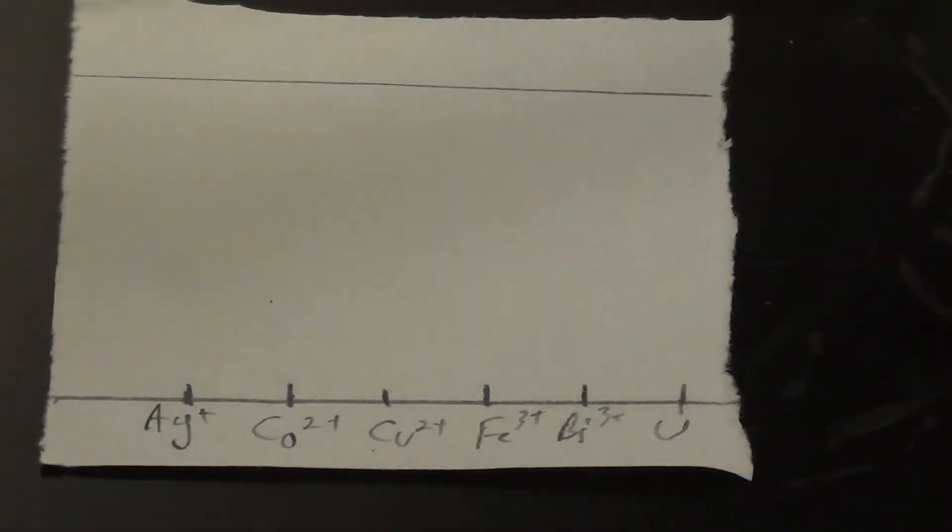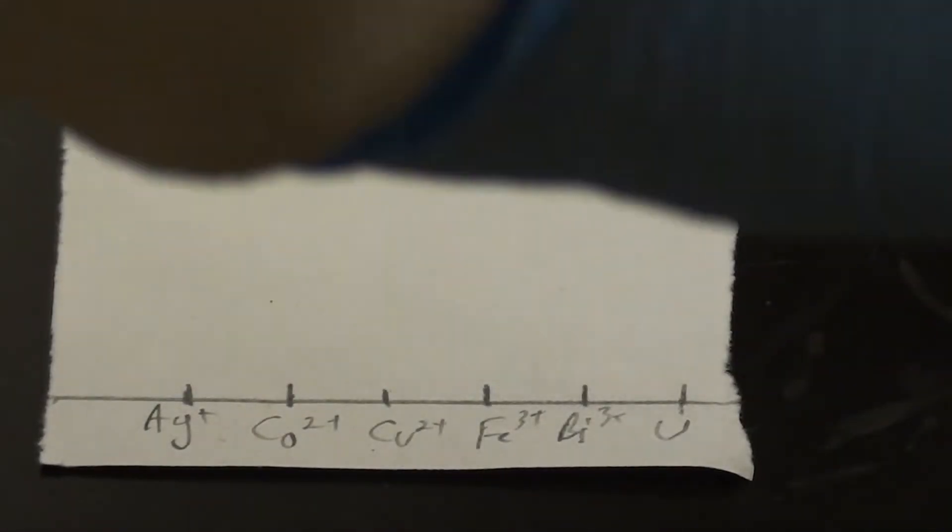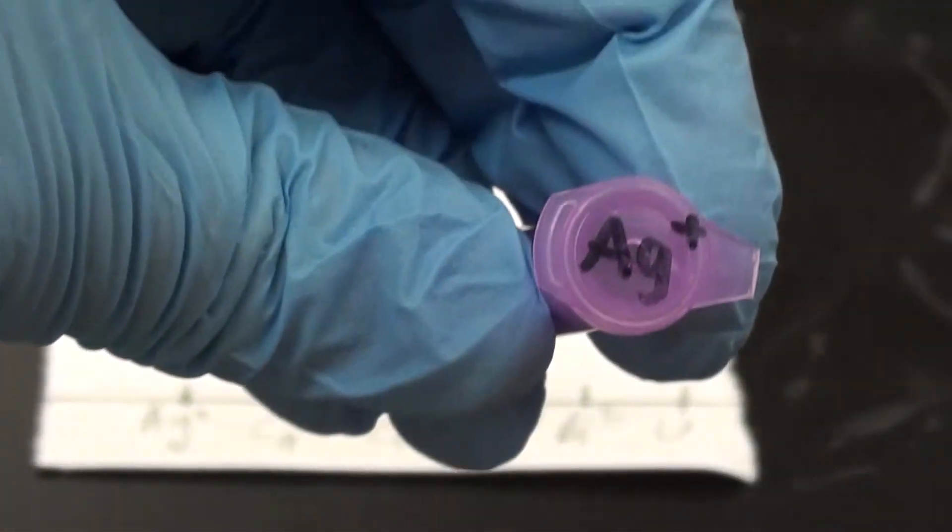What I'm going to do is I'm going to put this capillary into one of the samples. I'm going to choose the AG+ sample since that's the one that I want first. So let me open that up here, just as I did before. And there it is.